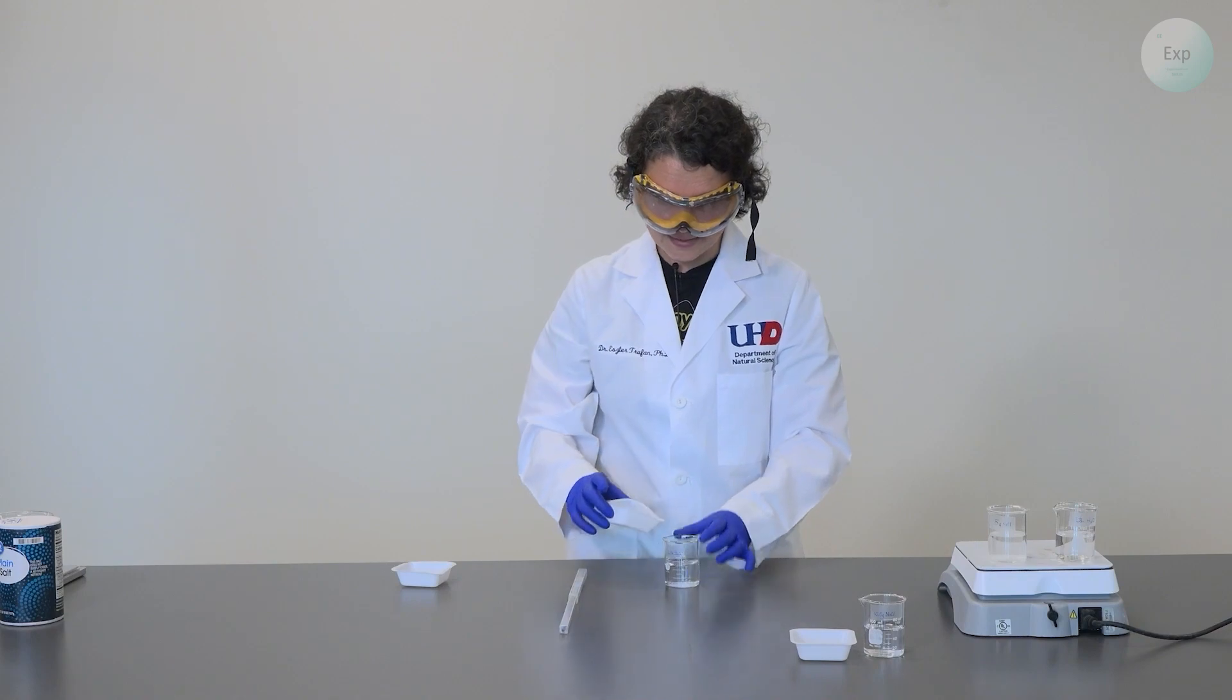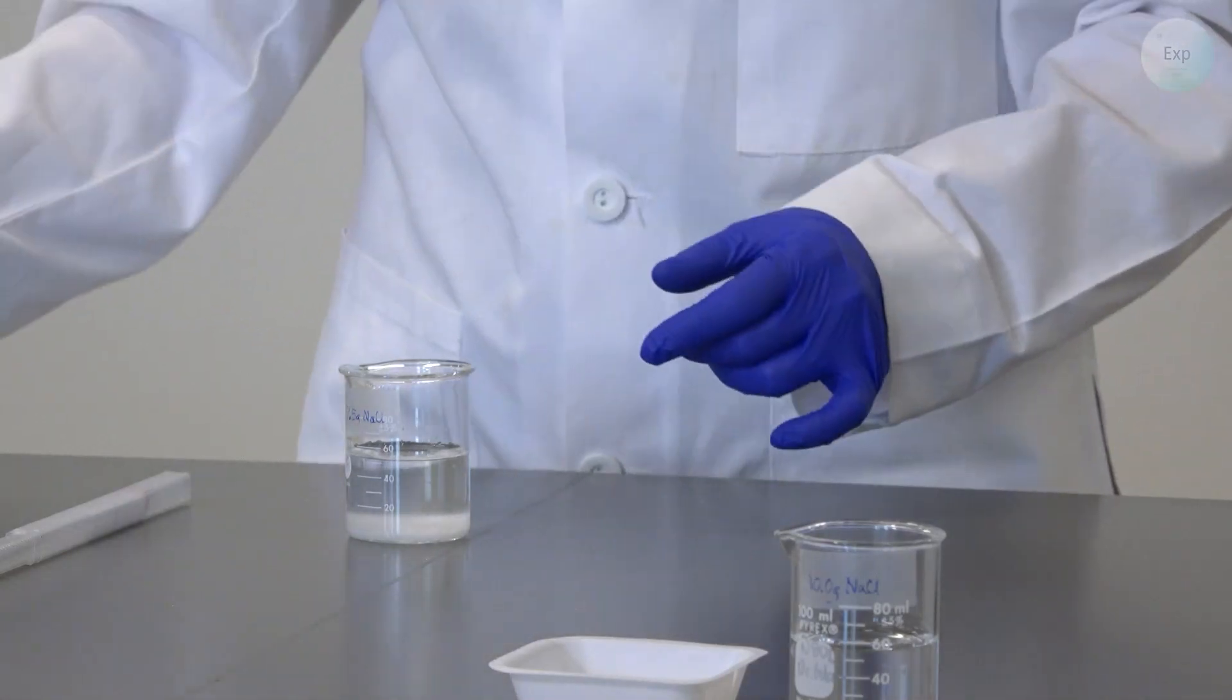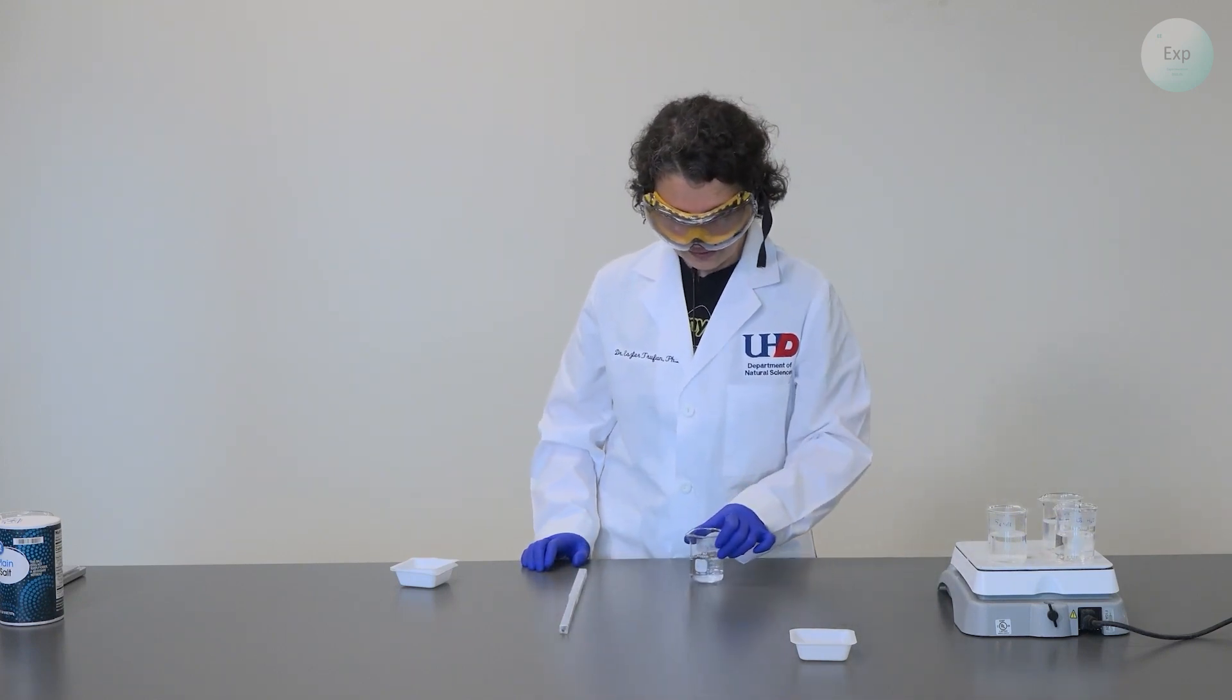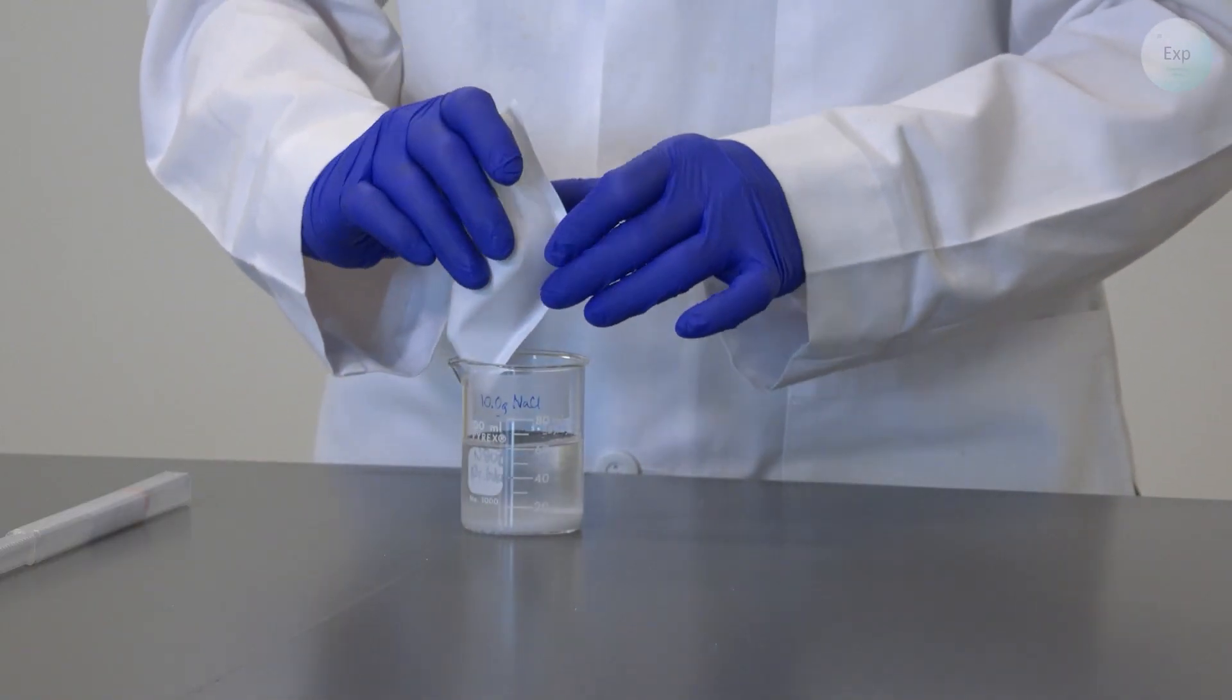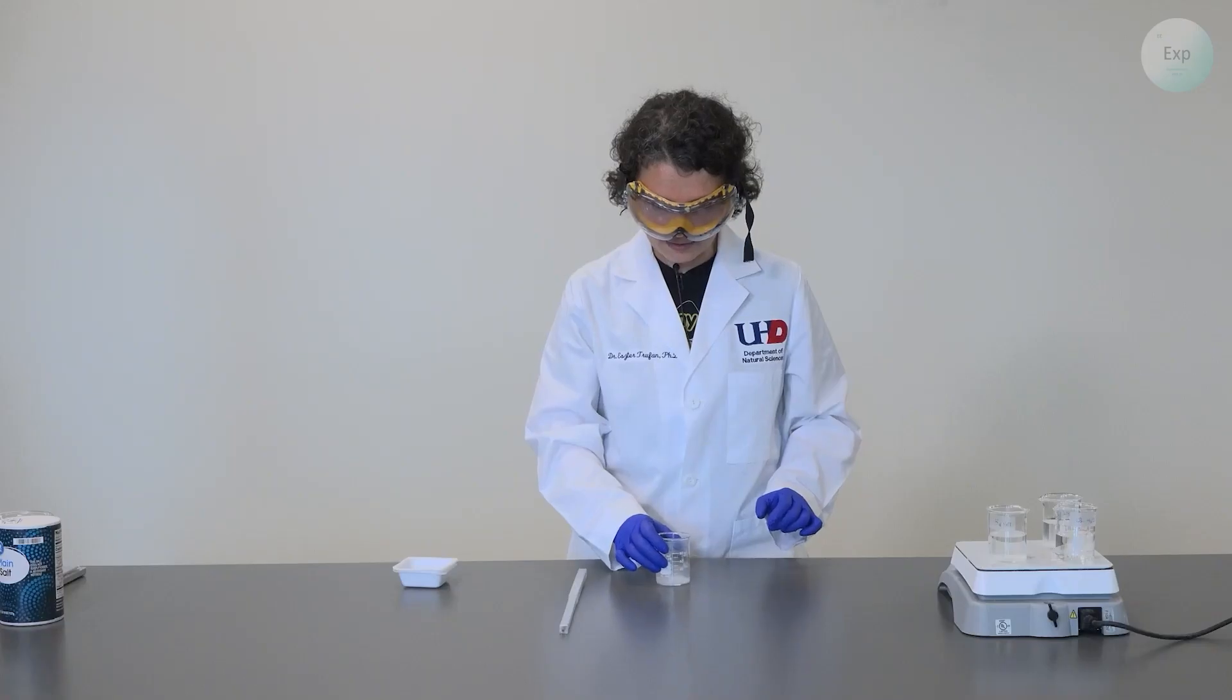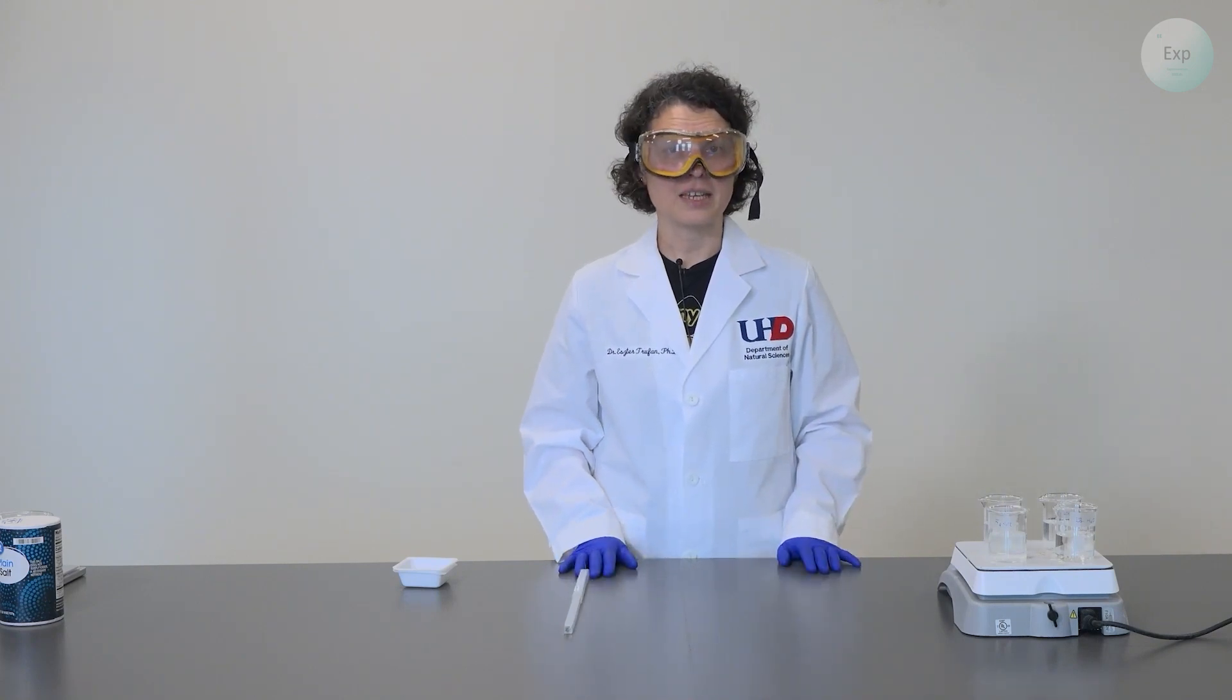Next, I will transfer my 7.5 grams of sodium chloride in my third beaker, set the weighing boat to the side, swirl the solution a little bit, and then transfer it onto the hot plate. Finally, I will combine my 10 grams of sodium chloride with the approximately 50 grams of deionized water. I will swirl this a little bit, careful not to cause any water to spill, place it on the hot plate, and then wait until it begins to boil.